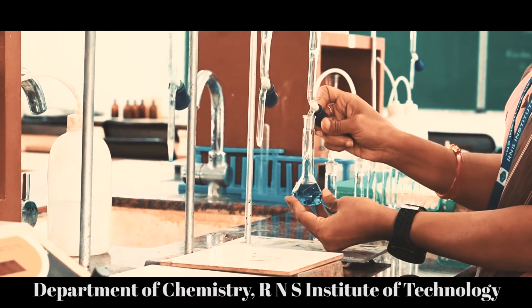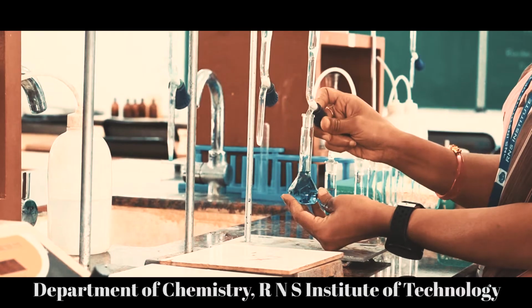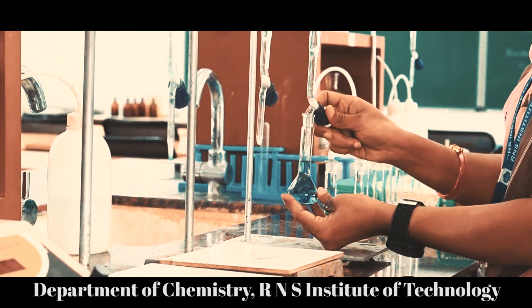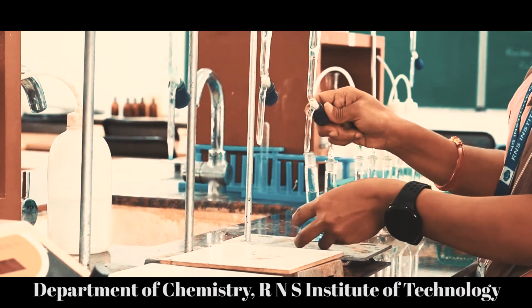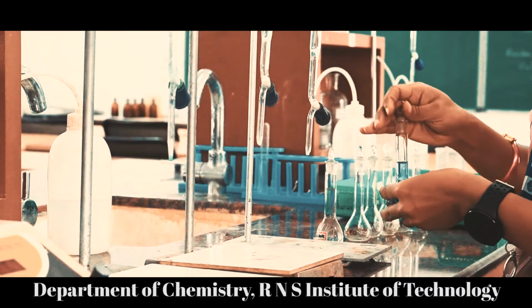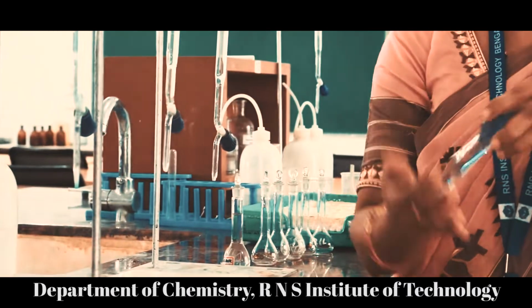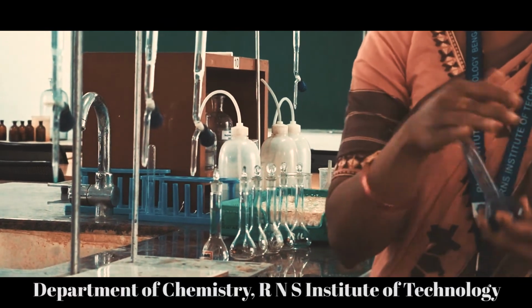You can see the appearance of a deep blue colored solution. That is because of the cuprammonium sulfate monohydrate complex formed. Close the knob and shake it 10 to 15 times so that uniform concentration is achieved.